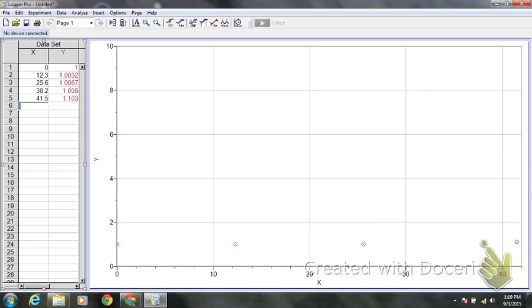Now that graph stinks, right? What's wrong with that graph for once? One thing. My scale is terrible. Okay. So let's look at how we're going to fix that. We're also going to have to make it so it says what? Weight percent and density. Okay, we need to fix that. So look how I'm doing this.